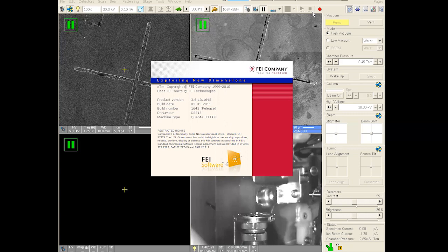All the shortcuts that you're going to learn today are very specific for this instrument. Now, I have noticed that in more recent instruments that Thermo Fisher makes, they have kept the same shortcuts and have even added to them to make it more functional. So everything you learn today, you will be able to apply to other instruments, but there may be slight differences. So just be aware of that.